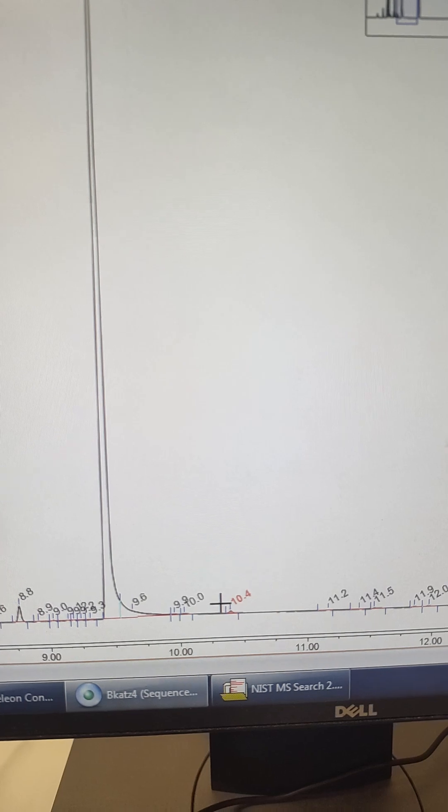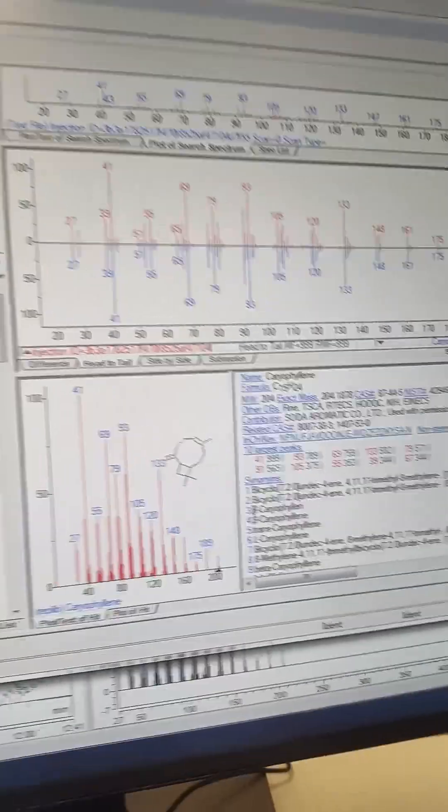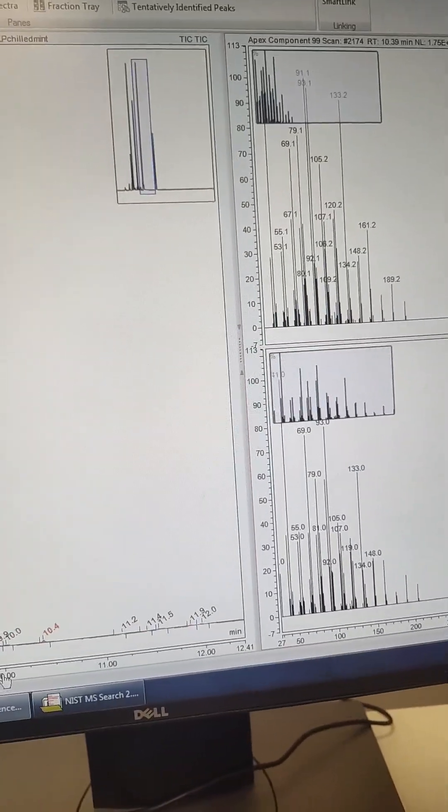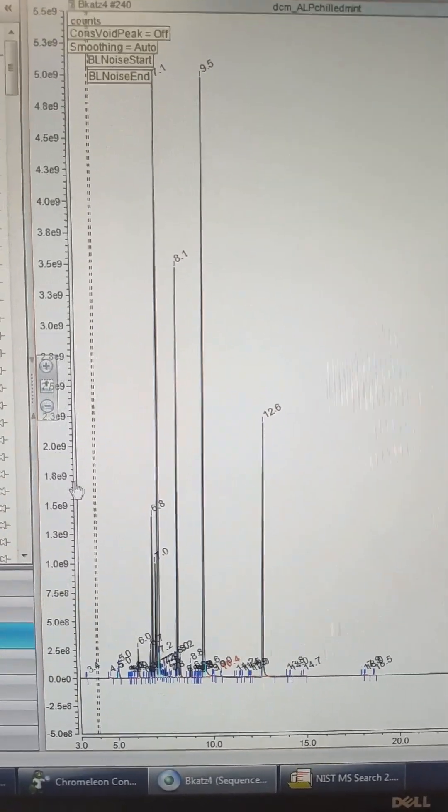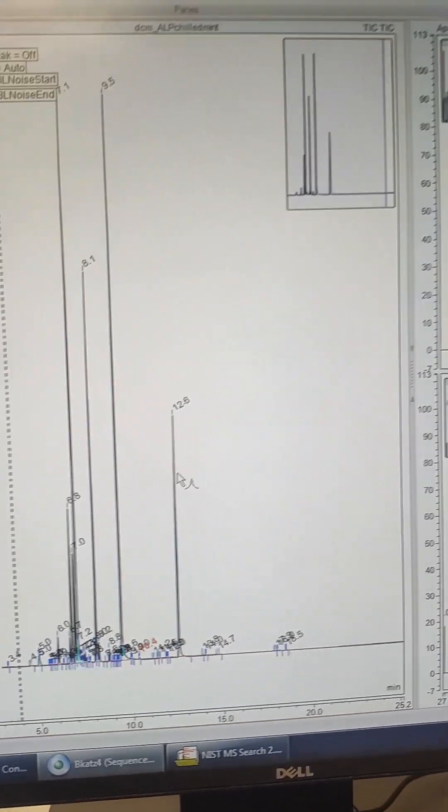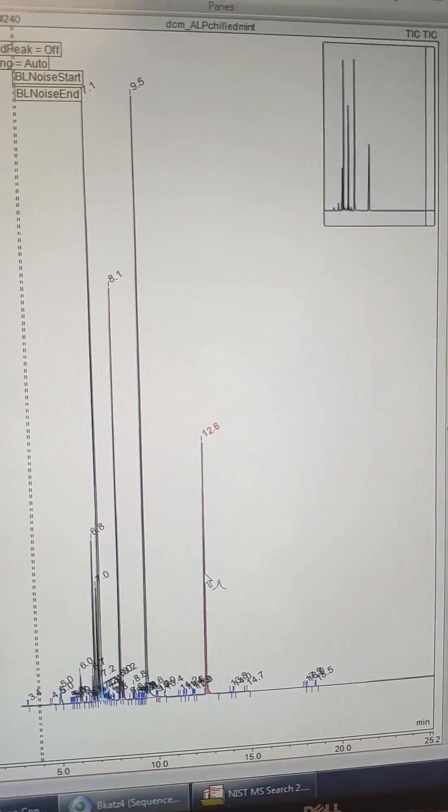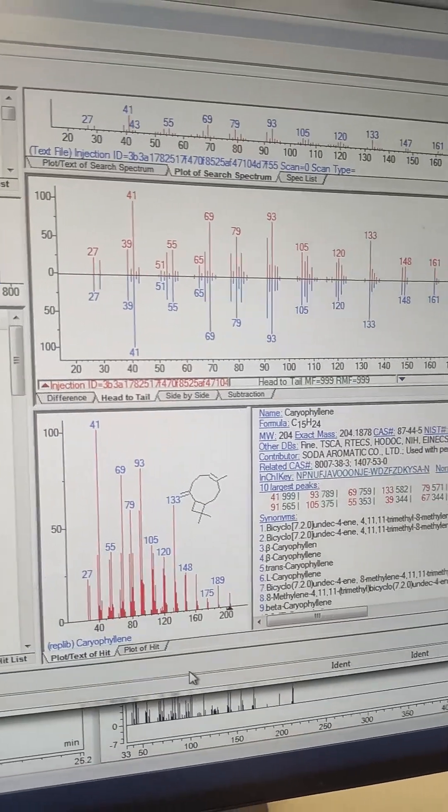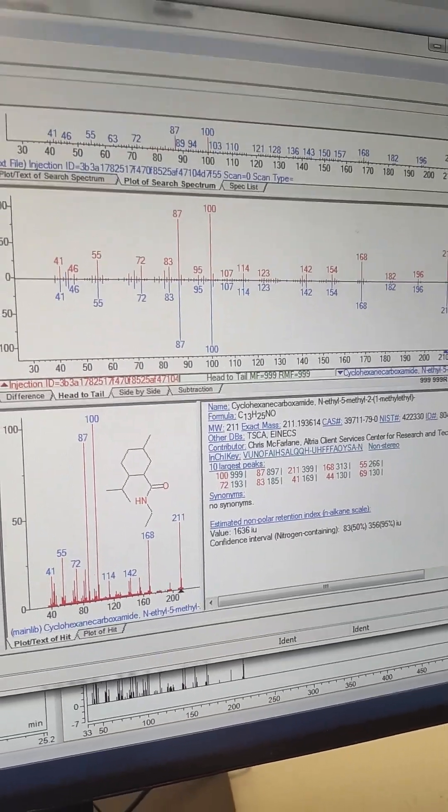Now this would be concerning if that was an impurity there at 10.4, but it's not, it's caryophyllene. That's a terpene, a flavor. You know, the thing I noticed, these things have a really strong smell and flavor and that is represented in the data. They're also really chilling which means lots of synthetic cooling agent. You can see it's almost like a 2-to-1 ratio with WS3 synthetic cooling agent. So you got plenty of synthetic cooling agent in there. You know I'm not a fan of synthetic cooling agents, but you know, the more you know.